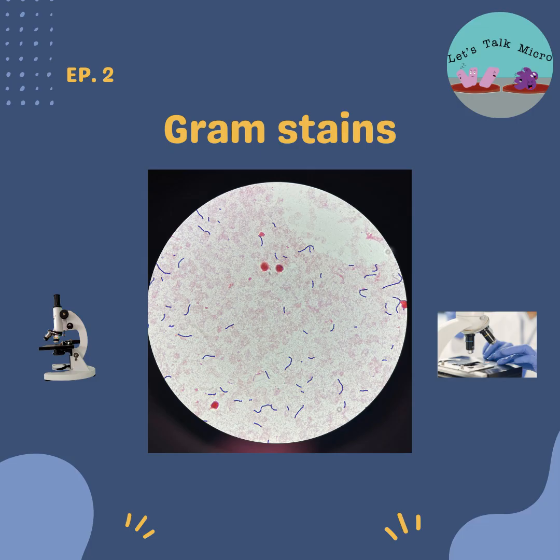Normally you have these types of fluids in your body, like pericardial and peritoneal, but then you have a disease condition or a process that can cause a buildup of the fluid. Then they take out some of this fluid, we receive it in the lab, and then we put it in our agar. So with body fluids, we actually prepare the smear by something called a cytospin.